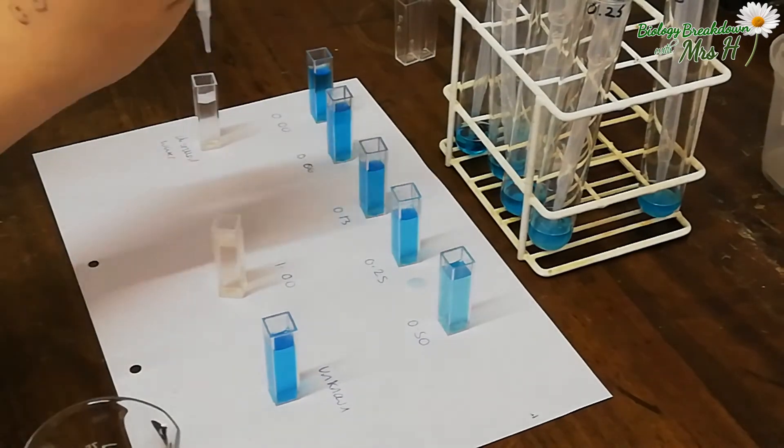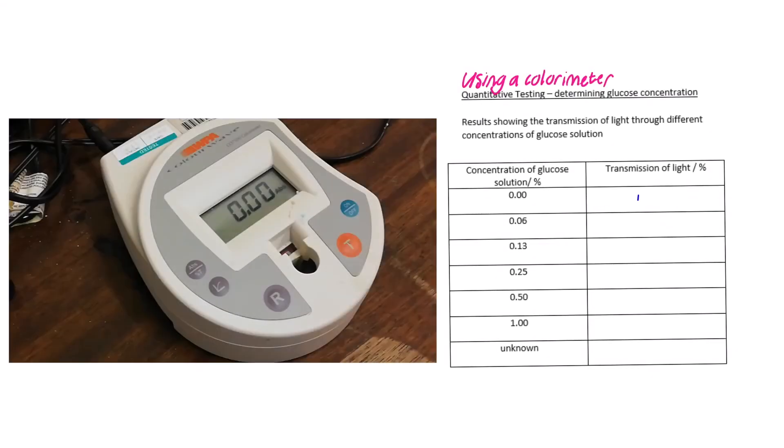This is a colorimeter. It can either be used to measure how much light is absorbed by the solution in the cuvette or how much light can pass through. We are going to measure the percentage of transmission of light through the solution. We need to put the distilled water in first and be sure to place the clear sides of the cuvette so that the light is passing through the clear sides and not the translucent sides. Then we press R to set the colorimeter to 100% transmission of light.